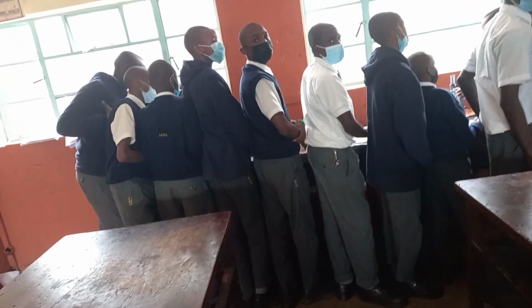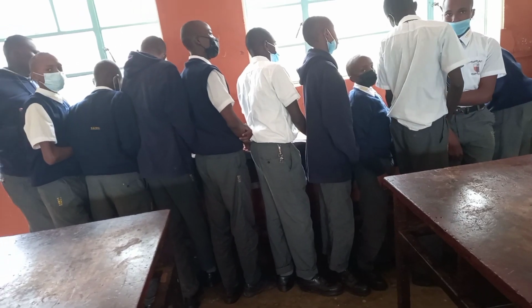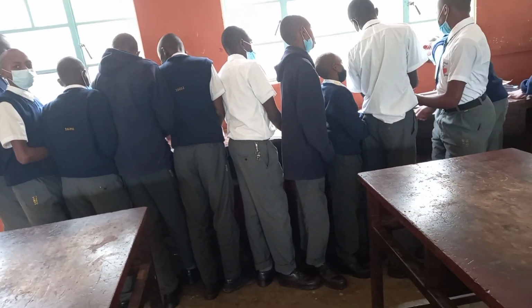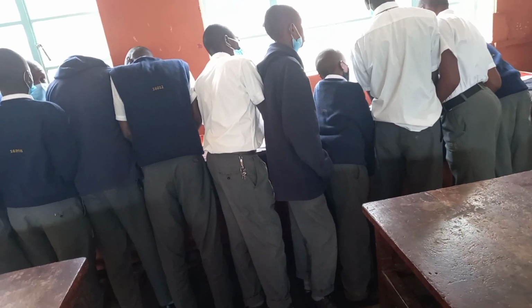Medium power is times 10. High power is times 45. Number 3. Ensure the diaphragm is fully open. Number 4. Look through the eyepiece with one eye. Meanwhile, adjust the mirror under the stage to ensure that maximum light can pass through.